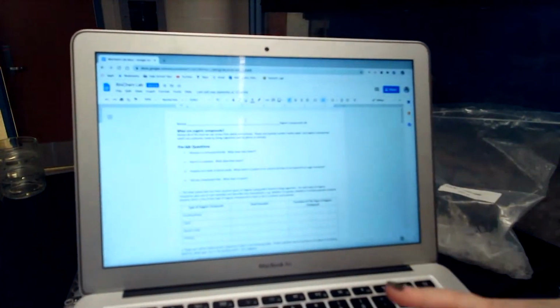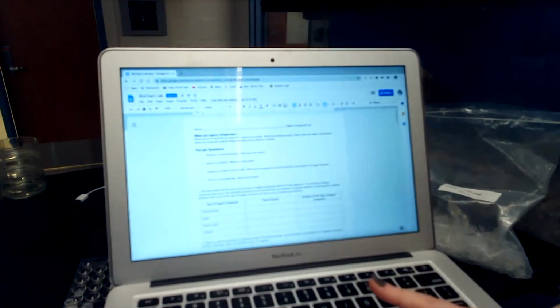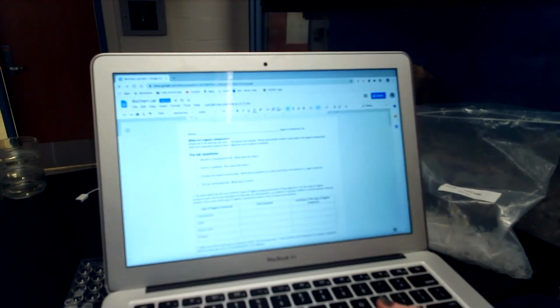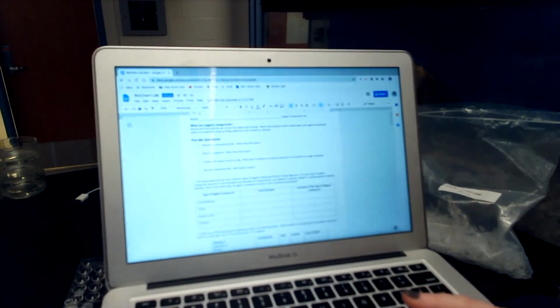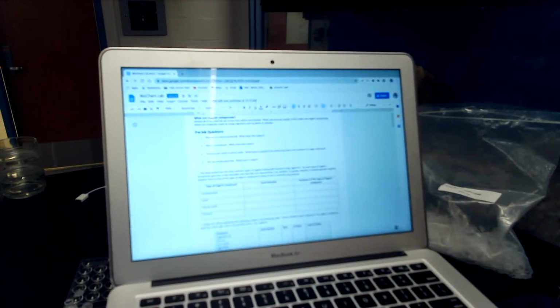All right. So number one, this is going to be the biochem lab. You're going to start off. You can pause this now to take a couple minutes to answer the pre-lab questions. So glucose is a monosaccharide. What does this mean? Starch is a polymer. What does that mean? I feel like you might have to come back to proteins. Proteins and oils we'll come back to because we're going to talk about carbohydrates today.